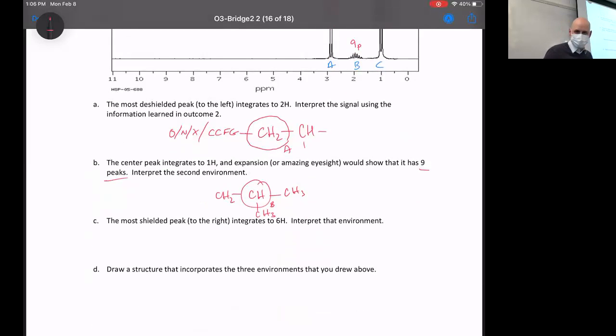So logically, it's those 2 right here, but we'll go ahead and write them out. It's 2 CH3s, both of which are next to a CH. So by circling them, I can see that I have a CH2, a CH, and 2 CH3s, and that's all the hydrogens I have in the molecule. Everything that I've written in terms of CH2s and CH3s and CHs that's outside of those circles, that tells us about our circled part's place, what it's near. But we don't have to have a CH2 and a CH and another CH2 and another CH and 2 more CH3s and a CH and 2 more CH3s. Right. The ones that aren't circled are just peripheral information.